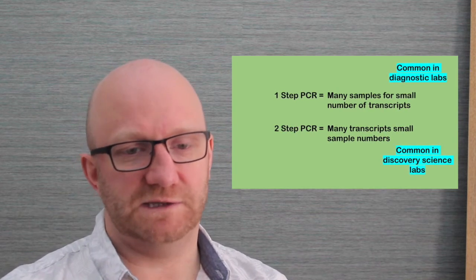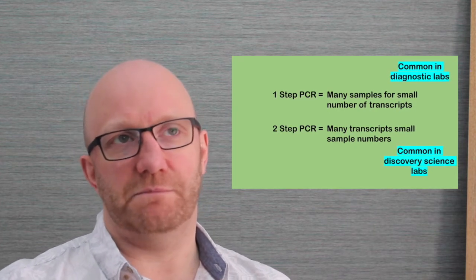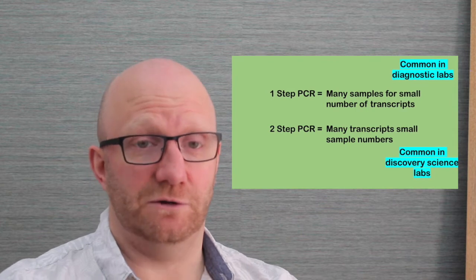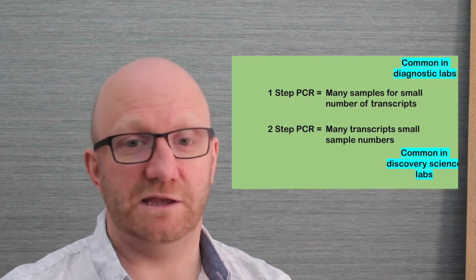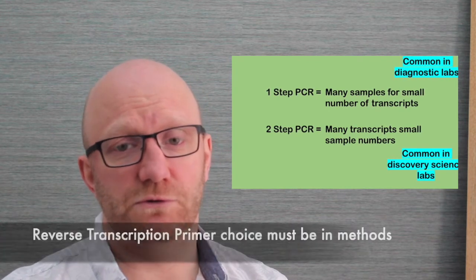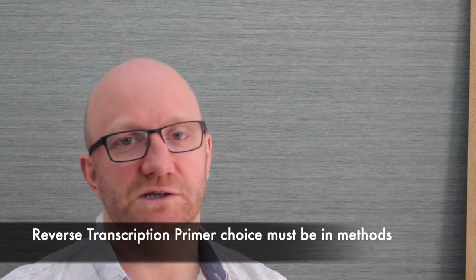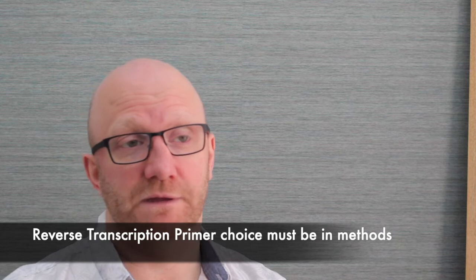In contrast, two-step PCR is more common in discovery science, where you have many different transcripts to look at with less starting material. So you made a manipulation and then you're looking to see 5, 6, 10 different genes. As with any other point where you are making a decision, the choice of which primer is being used in your RT-PCR step must be included in your methods section because it influences the interpretation of the data.